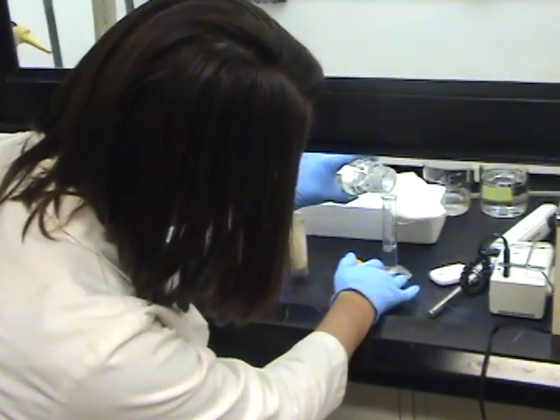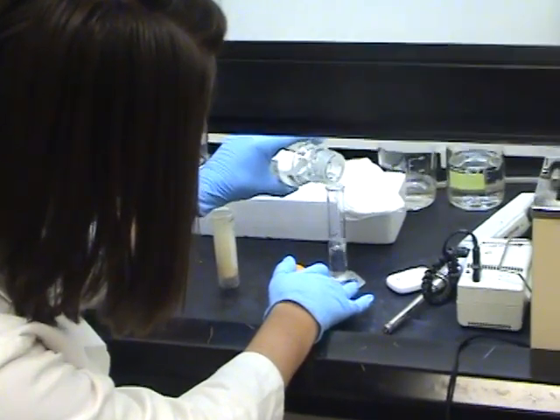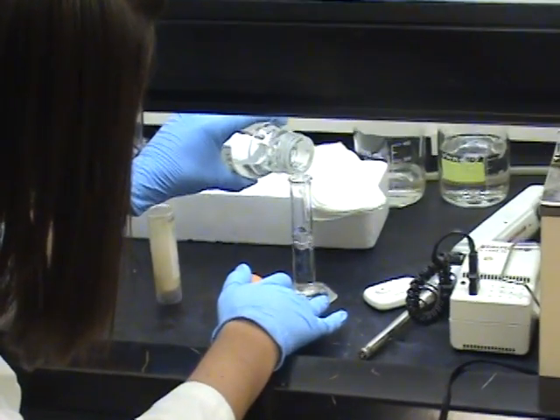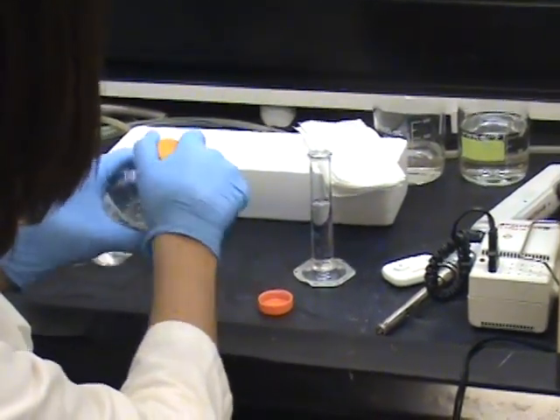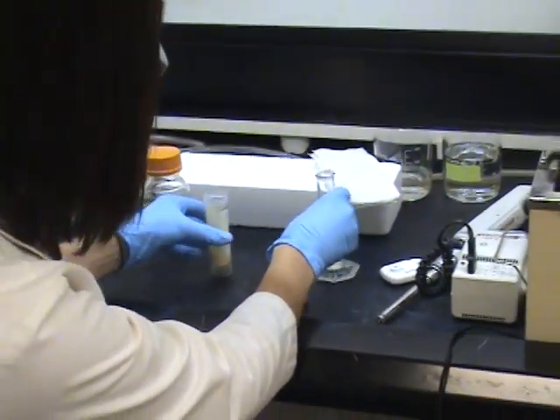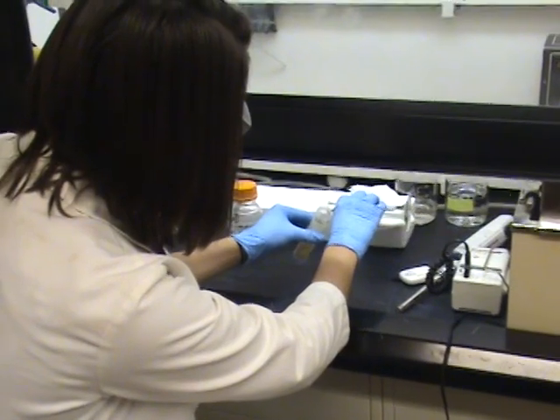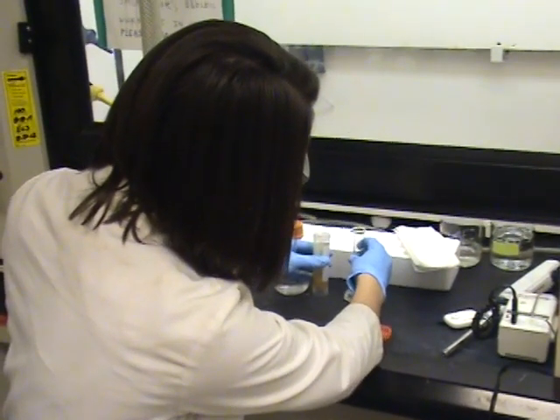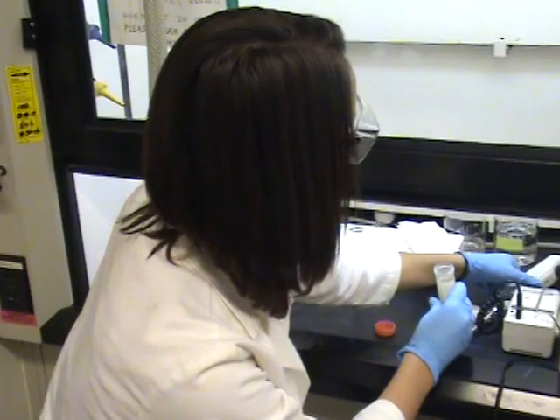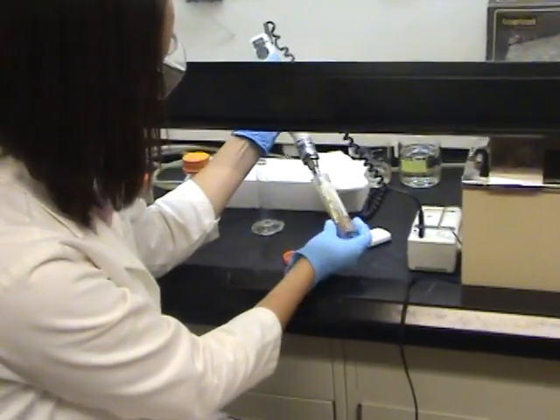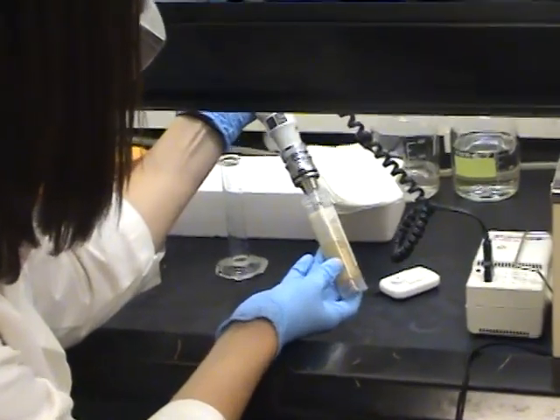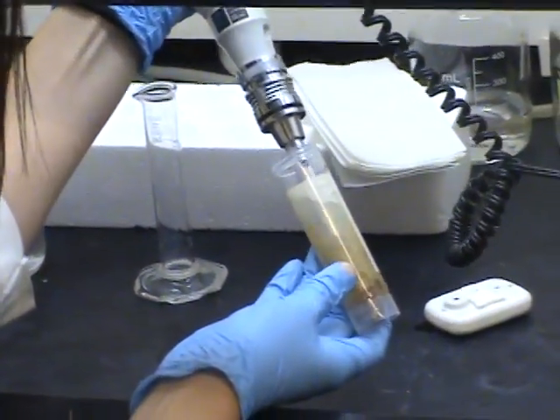To begin the lipid extraction, 20 milliliters of hexane is poured in the dried algae sample. A homogenizer is used to break apart and disrupt the cell walls so that lipids can be extracted. The sample is homogenized for five minutes.